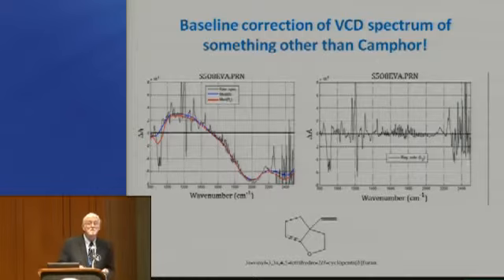This, I think, well, certainly it's the most versatile baseline correction technique that we've used in our lab, and it seems to work well on all sorts of spectra. So I'd like to leave you with that thought.